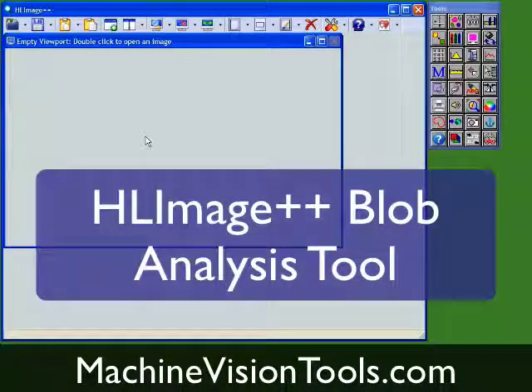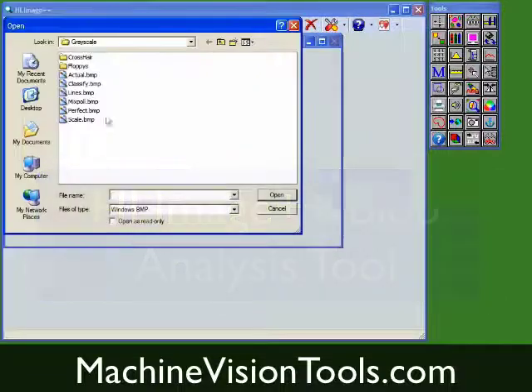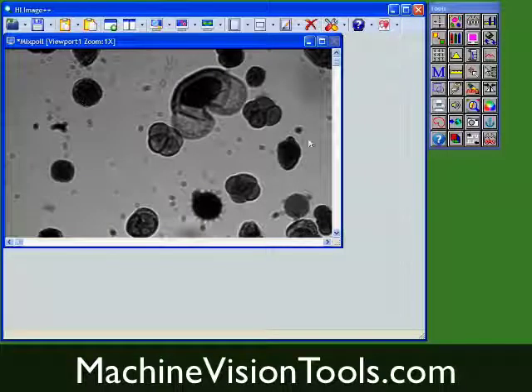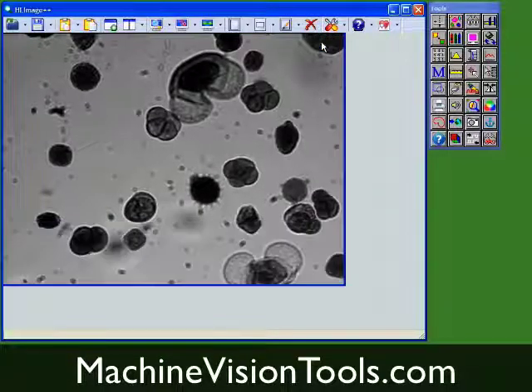This is a demonstration of the HLImage++ Blob Analysis Tool. In this demonstration, we'll use it to analyze a picture of some pollen grains.